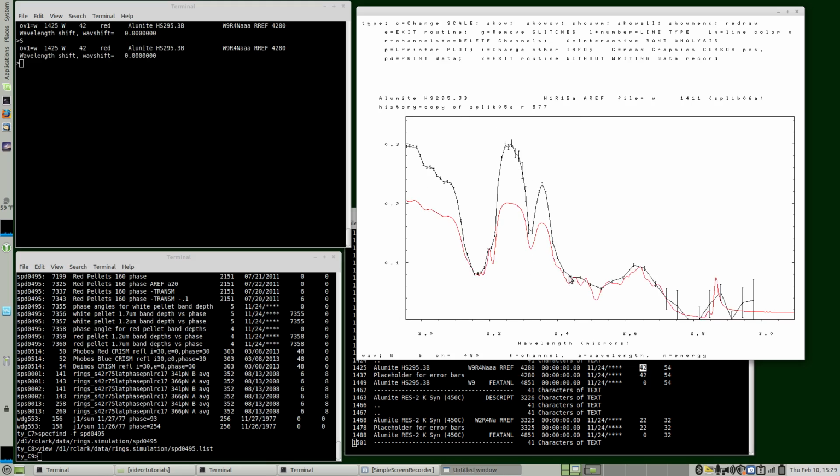We can see that the black spectrum has low resolution out here, and the error bars get high as we get to 3 microns. The other spectrum is an FTIR. Notice we resolved this absorption band better. This is an FTIR spectrum versus a Beckman grating spectrometer spectrum.